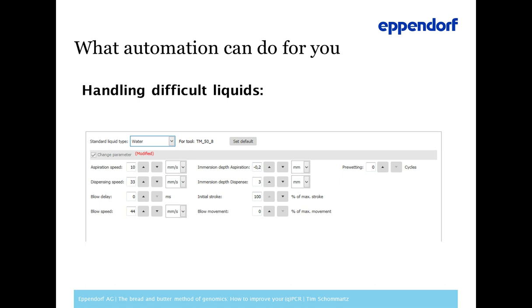I've mentioned that, right? I'm not entirely sure if this is a common, widespread term. So I learned it when I started here at Eppendorf, but that might also be a language thing, because as you might have noticed by now, I'm not a native speaker. So we distinguish between skirted or fully skirted, semi-skirted, or non-skirted plates.